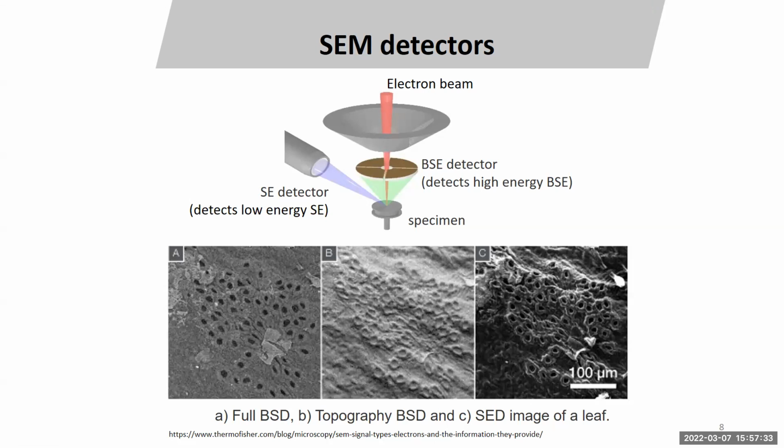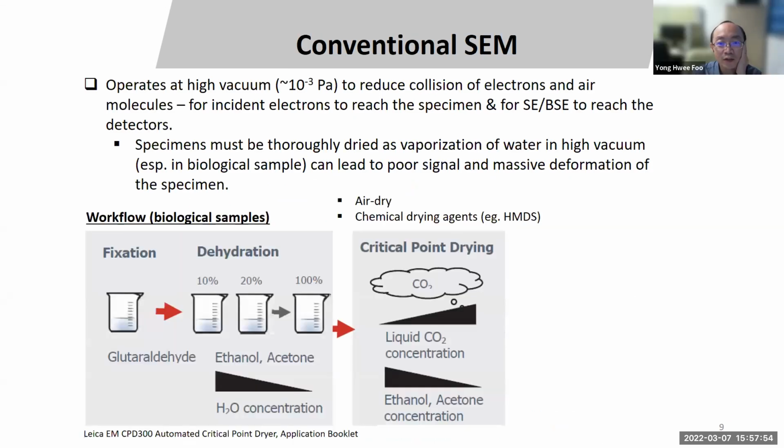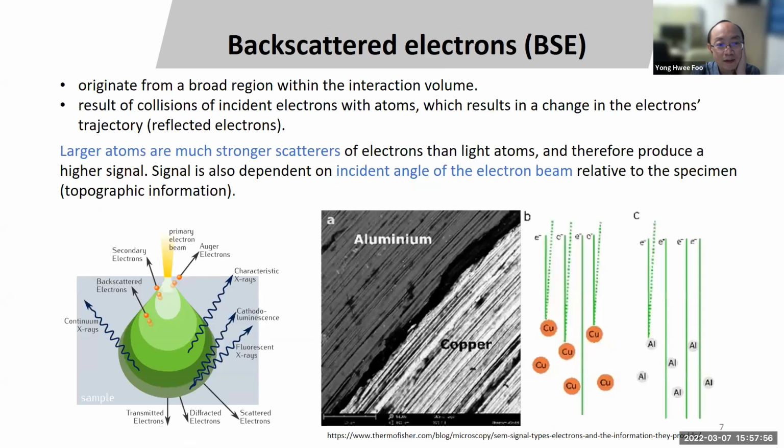And then a last question. You said that the sample shouldn't be wet. What do you mean? For example, a tissue sample would be kind of wet. Do we have to dry it somehow, or partly dry it? When I say wet, I don't mean the tissue sample is wet, but wet meaning it's in liquid media, or it's something like agar or agarose.